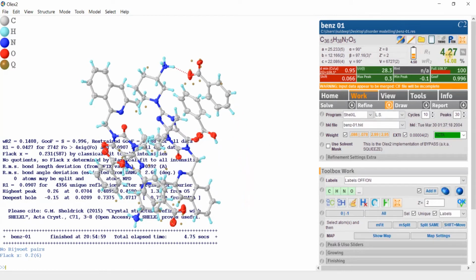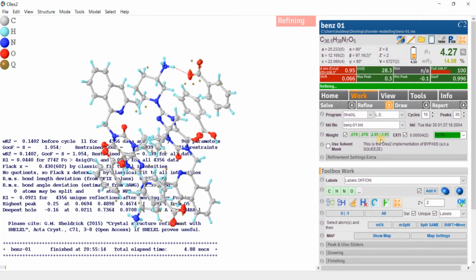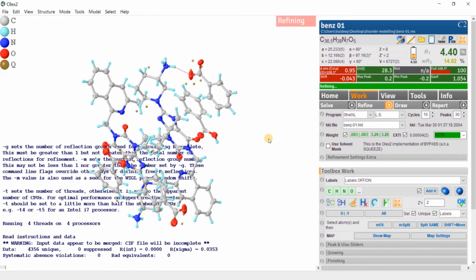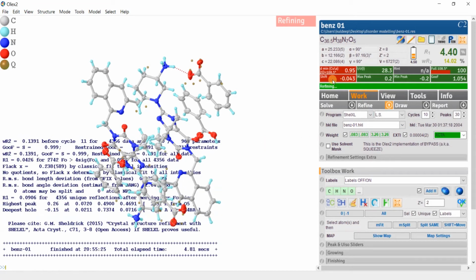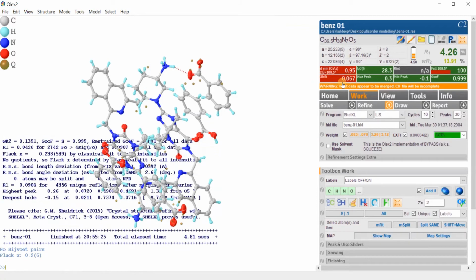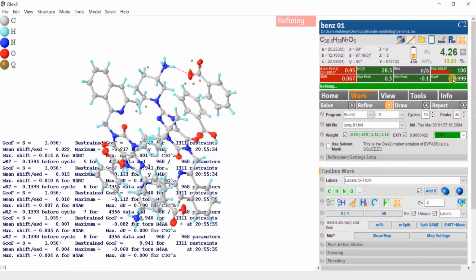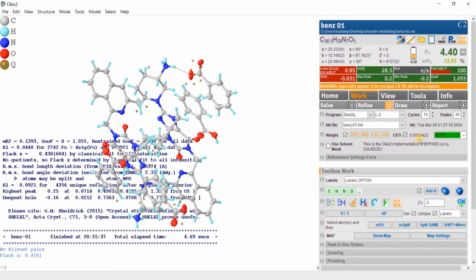So R factor is now 4.27%. Refine one more time so the shift gets stabilized and the weighing scheme becomes green. It will require some more cycles to converge the refinement, and you will see the shift is almost settling. The goodness of fit is now around 1. Completeness is 100%. The shift is getting further down. There is no need of the EXTI.